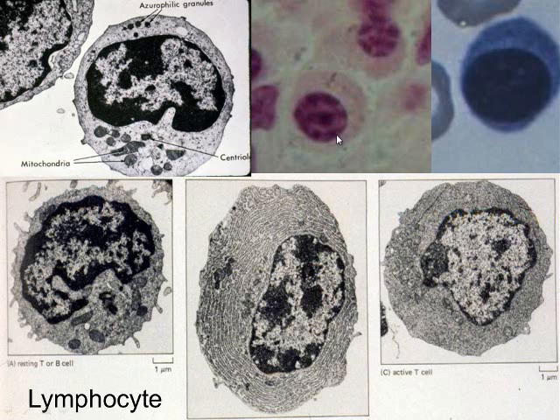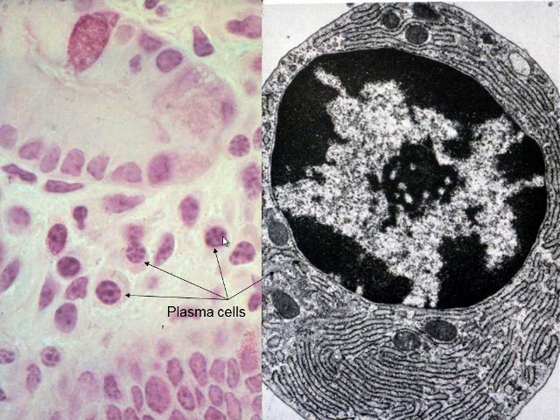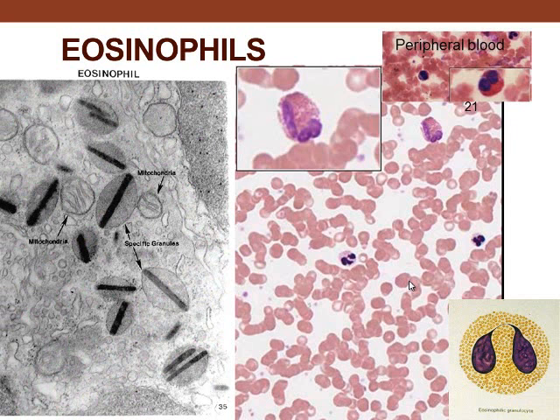You see the spherical nucleus, the cartwheel nucleus shape that you see here. Here's another one in through there. A lot of cytoplasm and the spherical nucleus is your plasma cells. And here we can see those cartwheel nuclei. The cytoplasm goes around here, and this cytoplasm has lots of rough endoplasmic reticulum in it because it's making antibodies. Here you can see your cartwheel nucleus. There are your spokes, and the hub of the wheel.